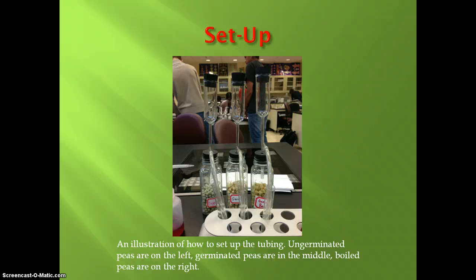Here's our setup. This demonstrates how we're setting up. Here's the respiration bottles, here's the rubber tubing, and the test tubes. Phenol red is in there. We haven't poured it in yet. Ungerminated over here, germinated in the middle, and the boiled germinated all the way on the right.